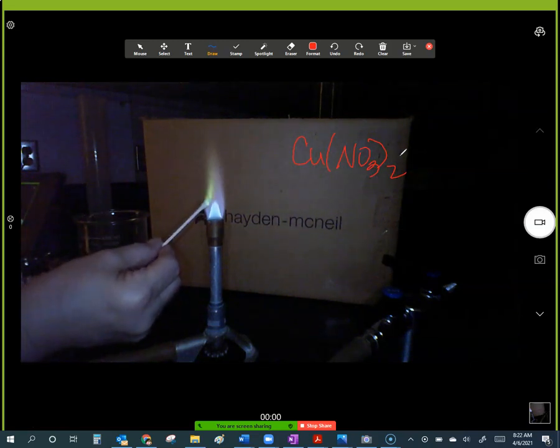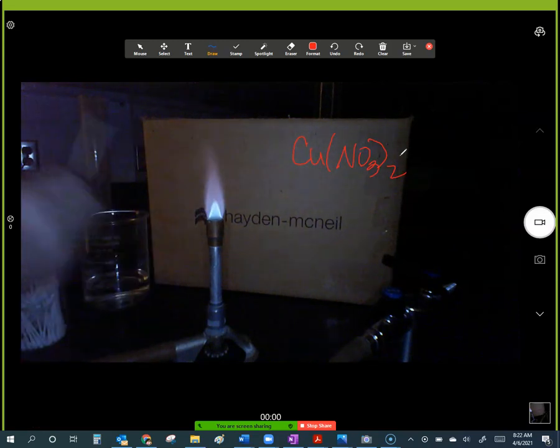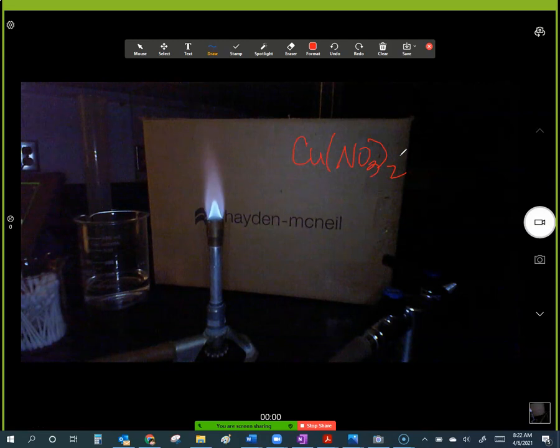What do you see? Somebody holler it out. And isn't that pretty? That's a nice green. So what does that mean? Well, how is light produced? What did we say happened when light was produced? What are the electrons doing?